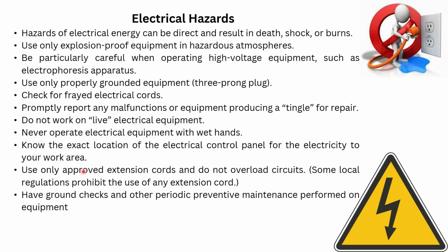Be particularly careful when operating high voltage equipment such as electrophoresis apparatus. Use only properly grounded equipment. So, the three-prong plug. The three-prong plug is the most common properly grounded equipment in the laboratory. Check for frayed electrical cords. Promptly report any malfunctions or equipment producing a tingle for repair.